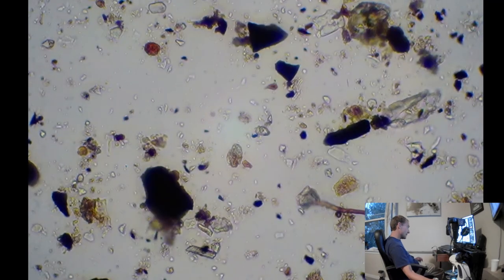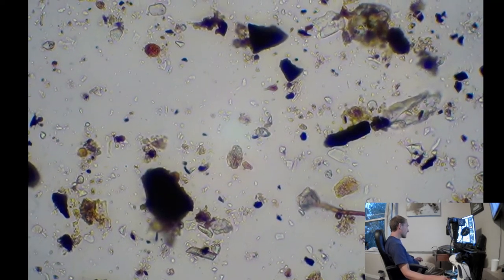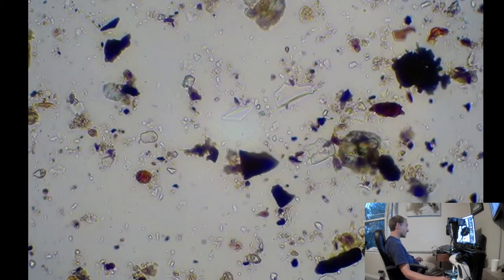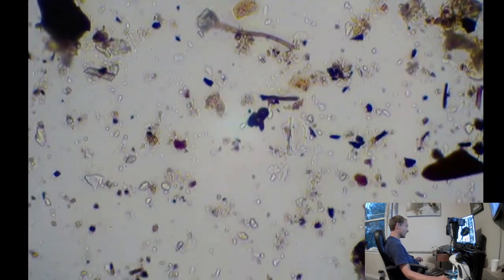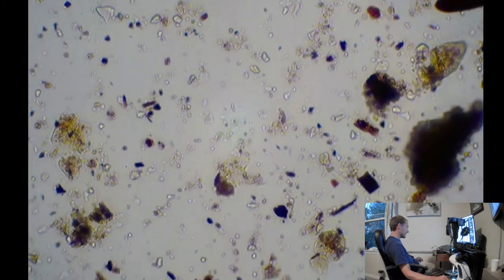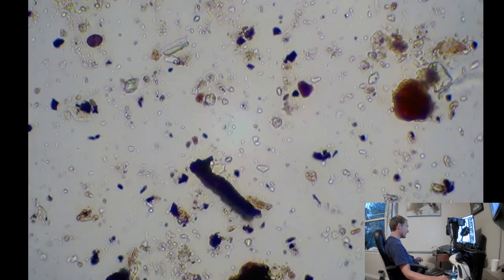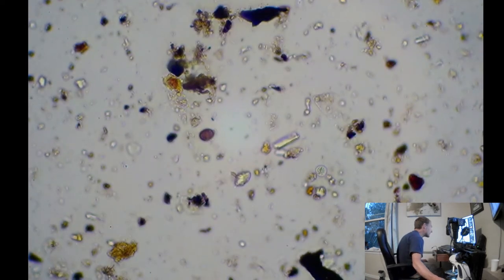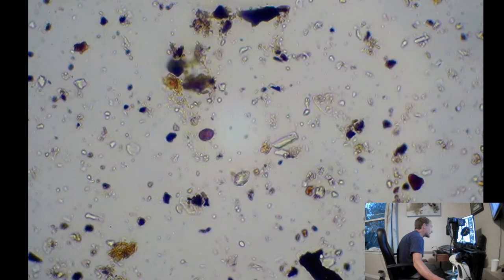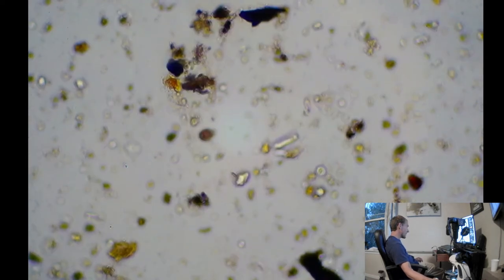Yeah, a couple nice, two little breaks. Nice color. Mostly humic acids that give it that color, and other nutrients that it's providing for your plants. Abundant nutrients, all sorts of good stuff. Alright. Plant matter there. Weird little perfectly round thing right there. Might become kind of a small amoeba. Usually a little bit bigger than that. I don't know.